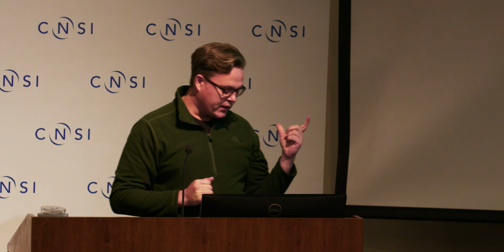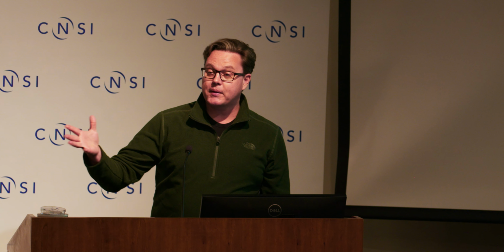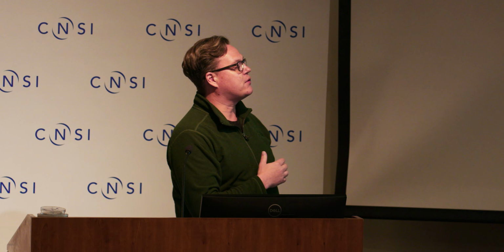The wavelengths inside an electron microscope are about 2 picometers in size. Optical microscopes are wavelength limited, so they can actually see the size of things that are on the order of the wavelength, so about 500 nanometers, or a little bit better if you have super resolution. But electron microscopes have wavelengths that are about 2 picometers.